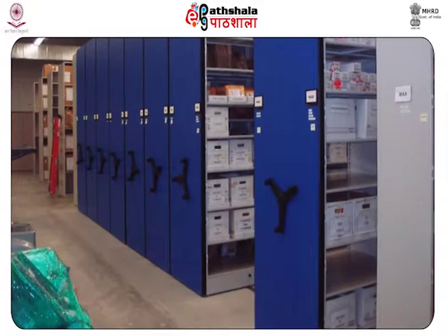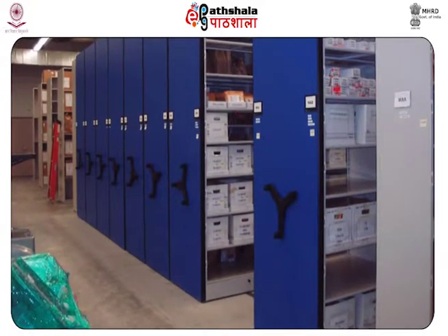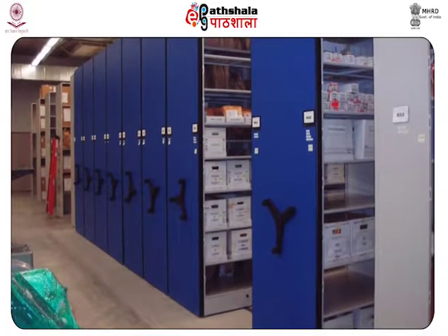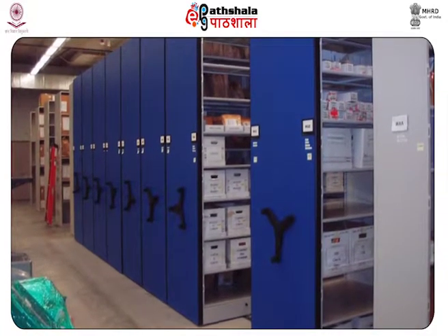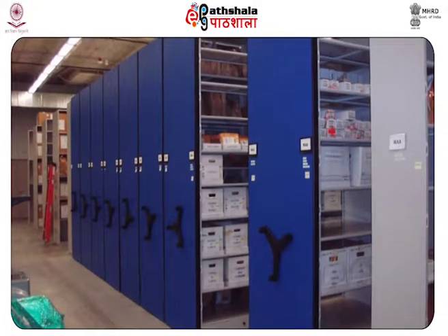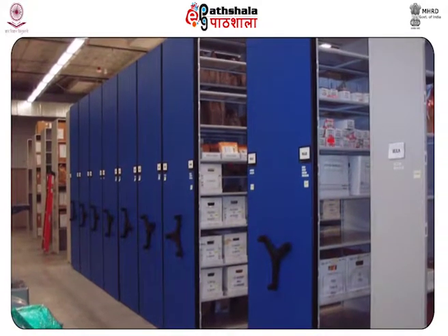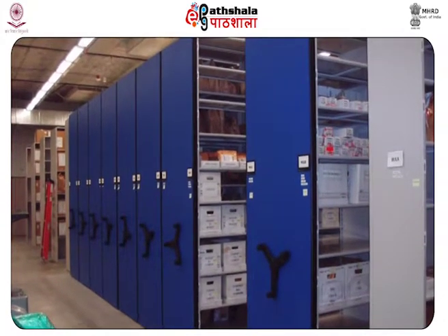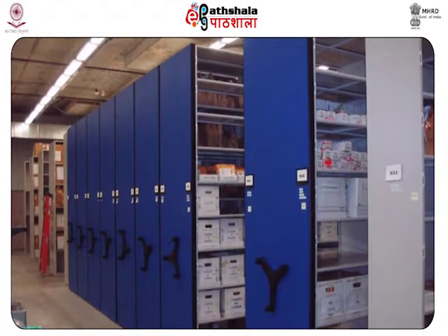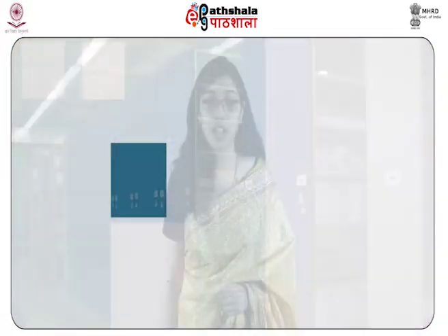Whole blood should be spotted onto a sterile cloth, bloodstain card paper or the FTA paper by the expert for storage at room temperature. Sealing of the packages is necessary in order to prevent the contamination and degradation of the evidences.